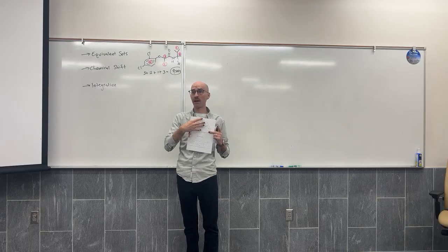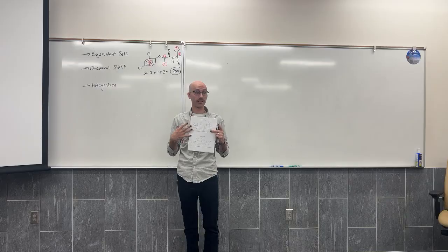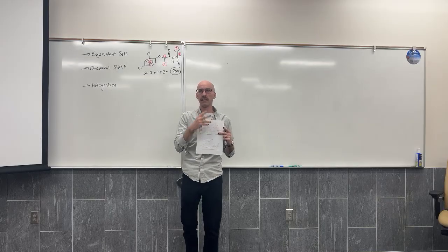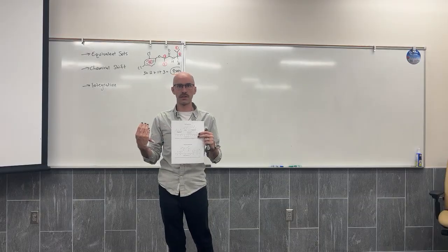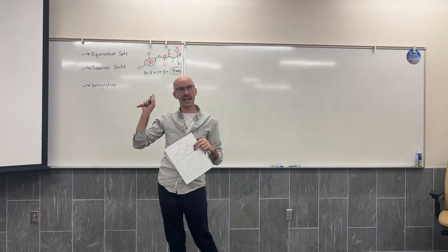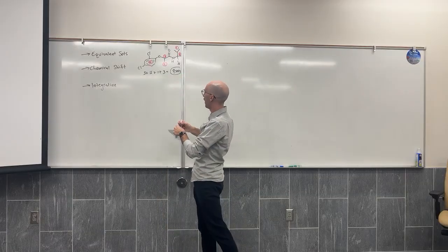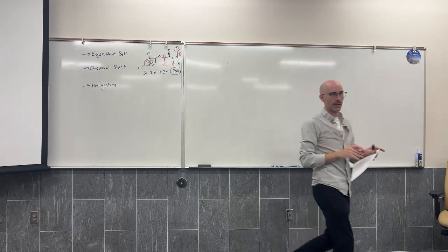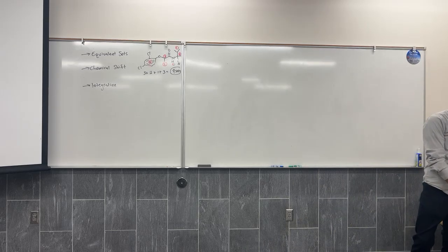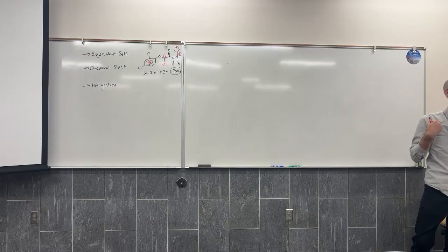They show up from 0.5 to 5, which is not like where the carboxylic acid shows up, and not like what you'd expect by saying the closer it is to an electronegative atom, the further to the left it goes. But the carboxylic acid is unique, and the amide might be unique as well. So I'll be honest, I'm going to leave that as a question mark because I'm not exactly sure where it's going to show up. It might be the furthest to the left. It could be the furthest to the right.